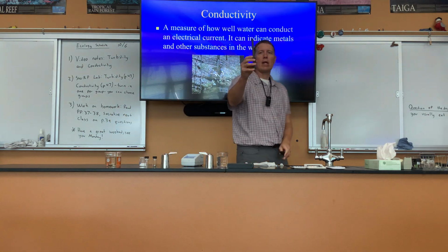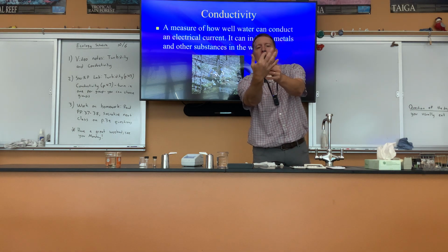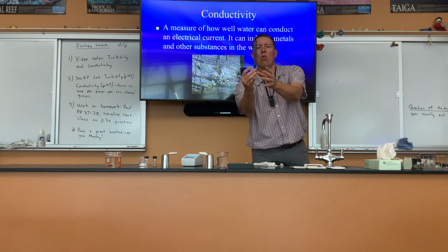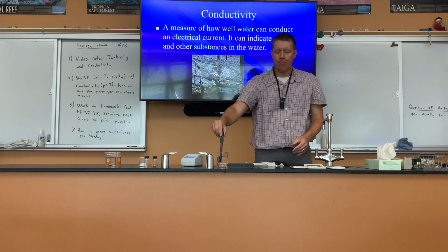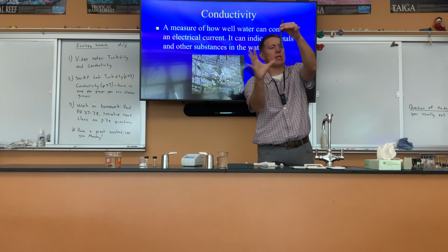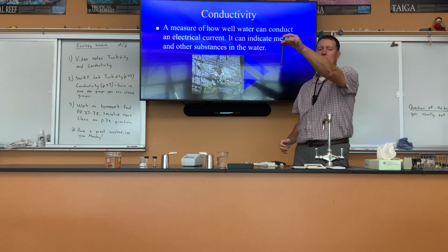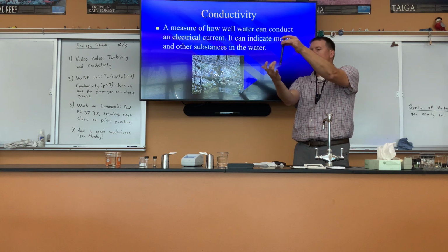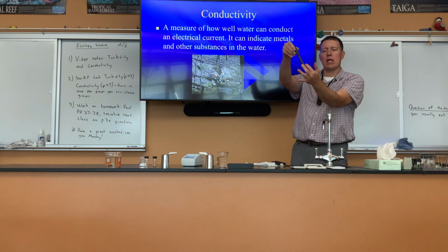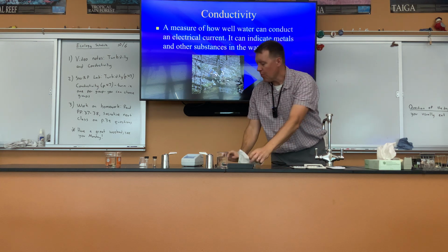This little tool right here, this is the wireless conductivity probe. It has a little gap right there in the probe. And so when I put that in water, it gives a minor little electrical pulse, not enough to shock you or anything like that. It's just a very small pulse that happens right in there. And that pulse measures how well the water conducts electricity between these 2 points in that gap in the probe.